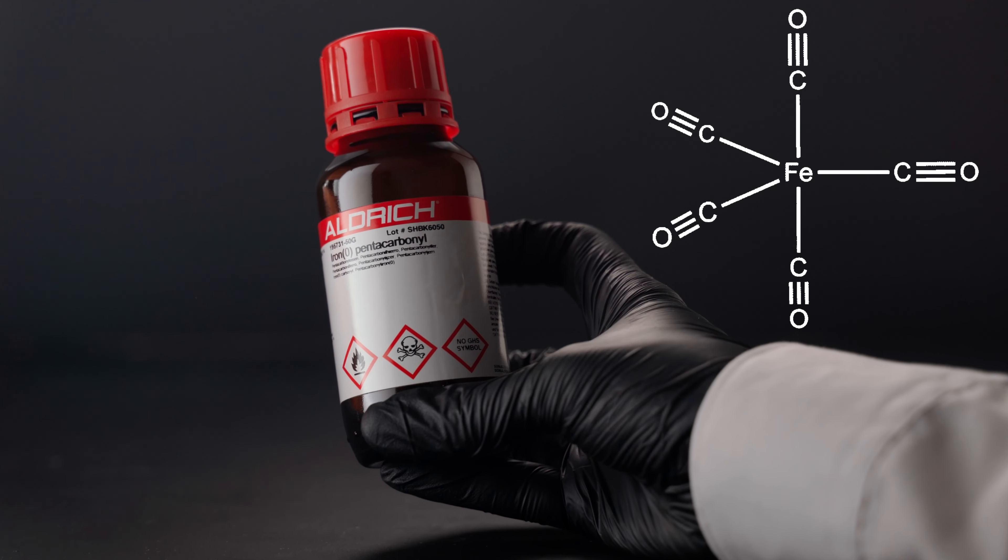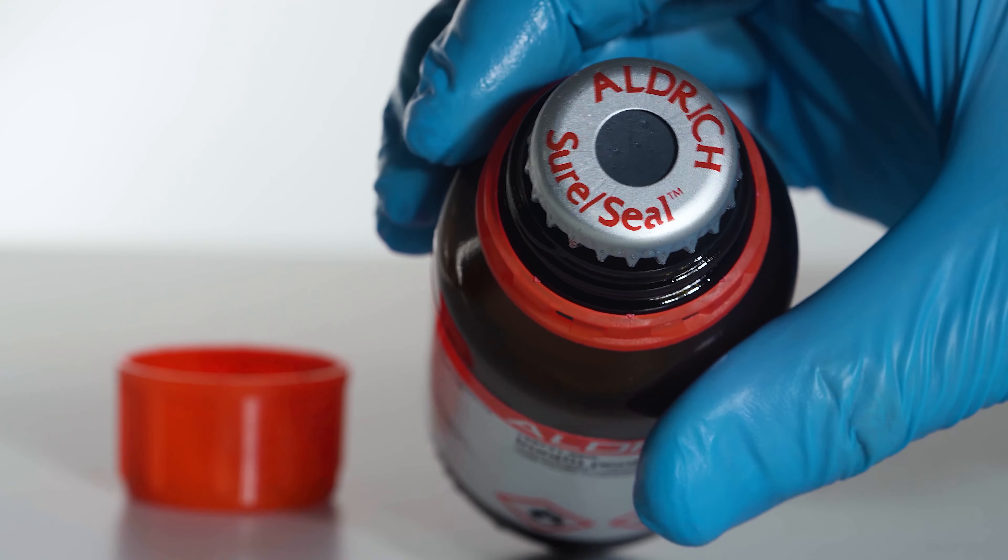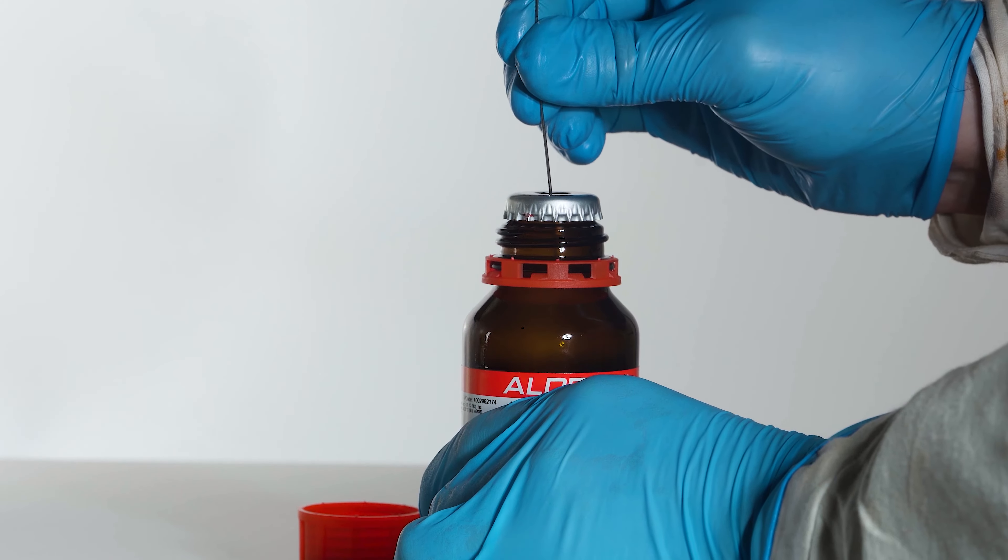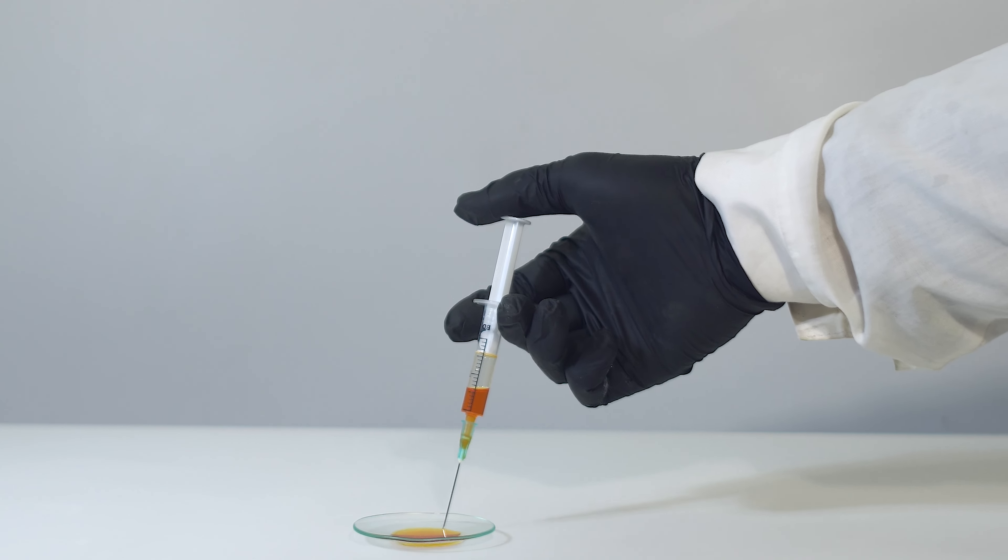The reaction between iron pentacarbonyl and tert-butyl hydroperoxide carries out with the formation of a mushroom cloud that burns down afterwards, turning into ferric oxide, or in other words, rust.